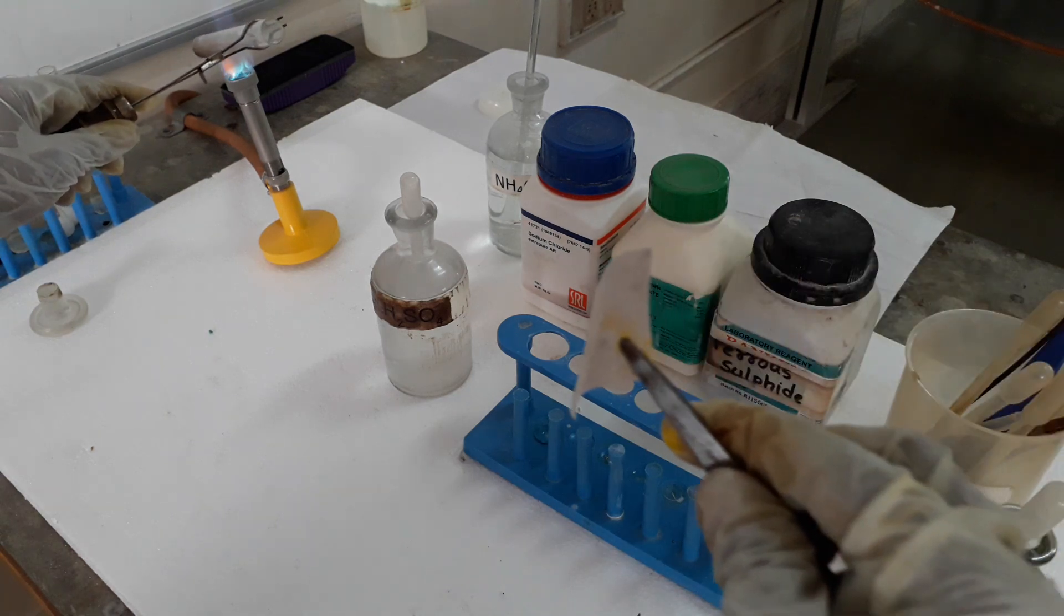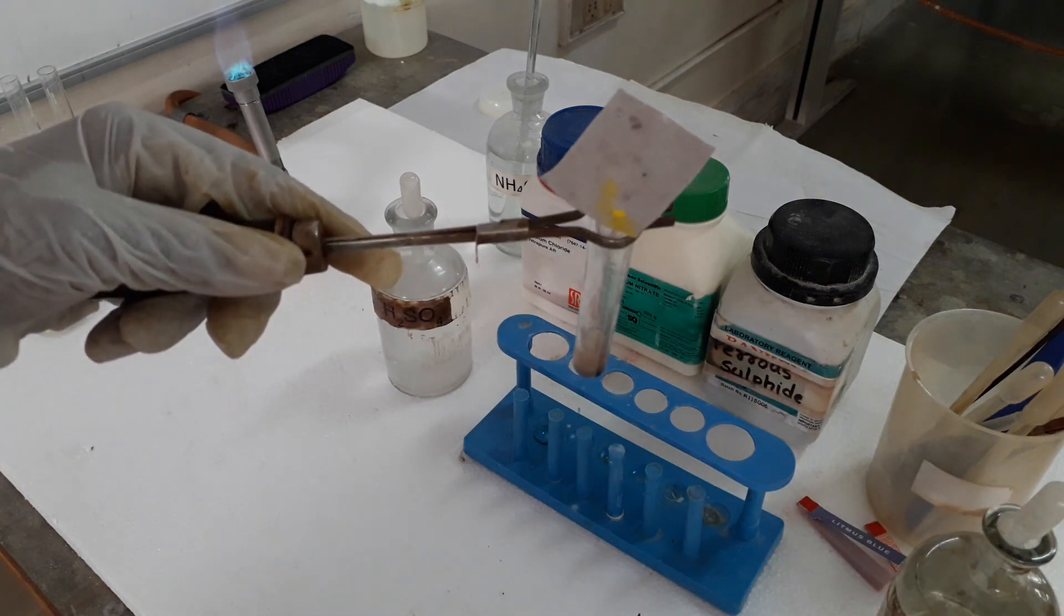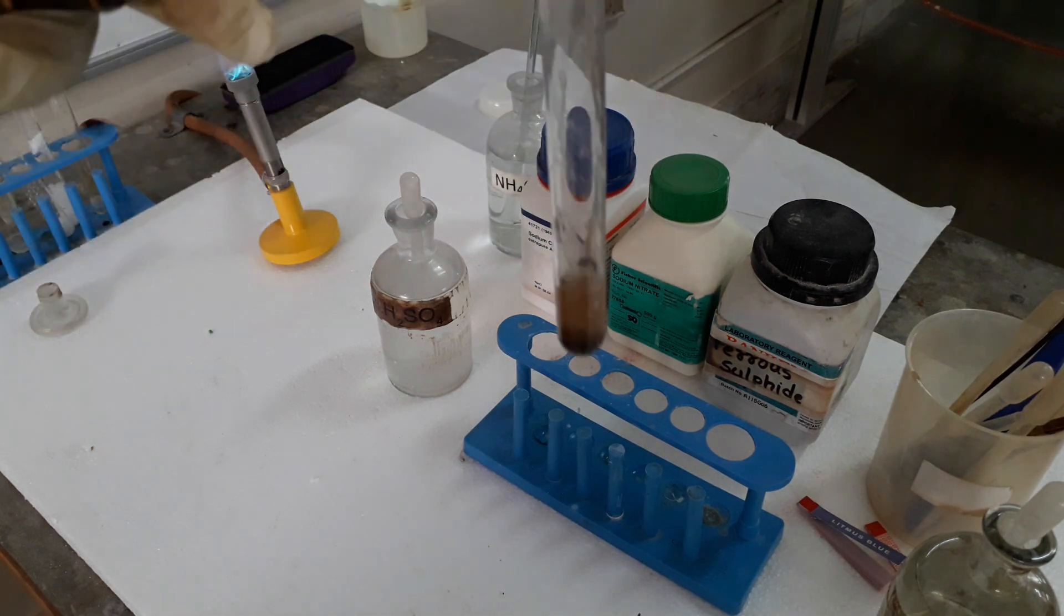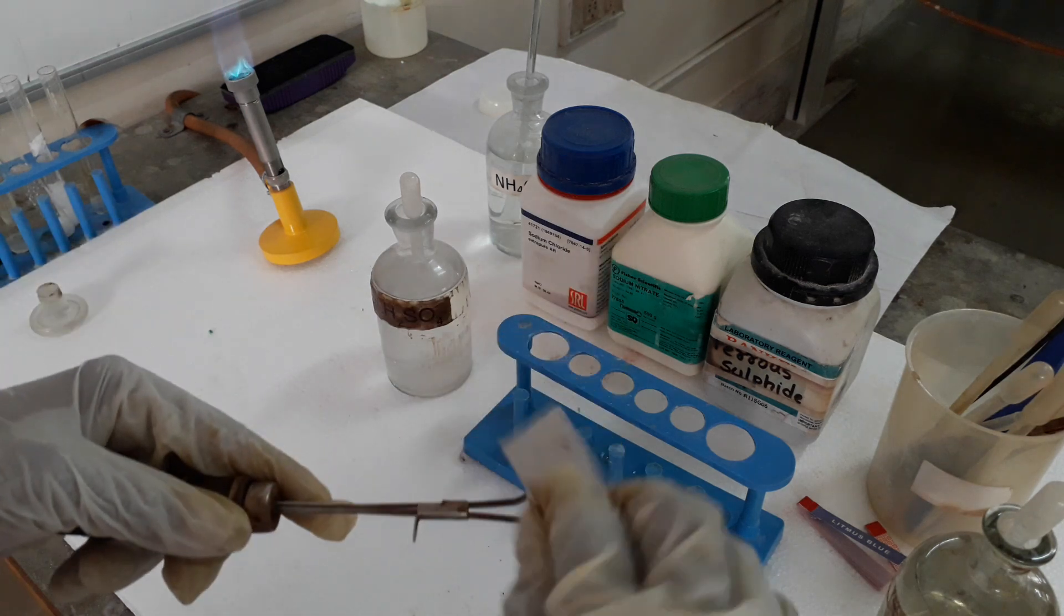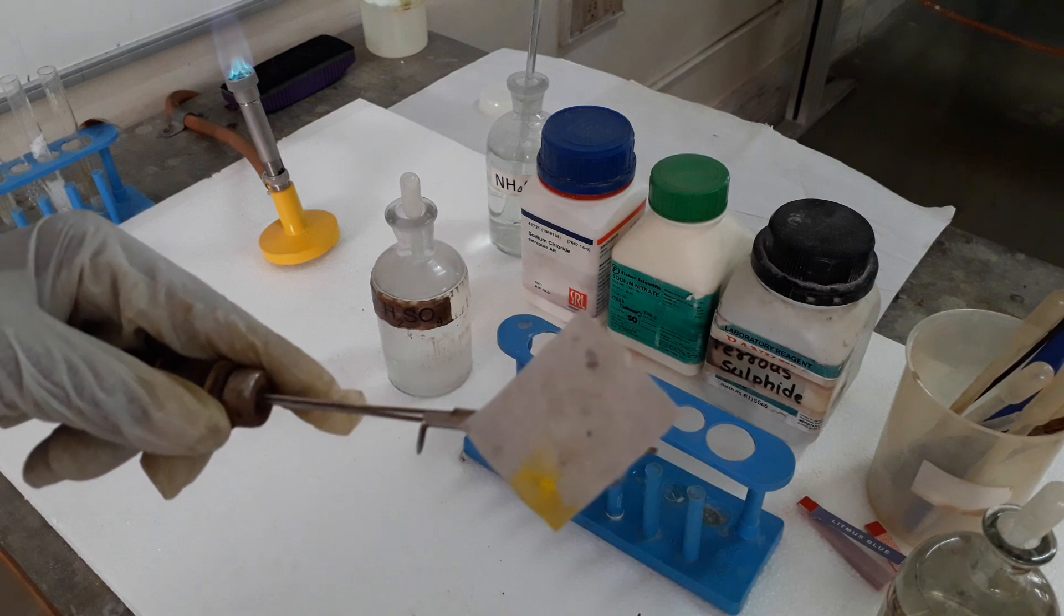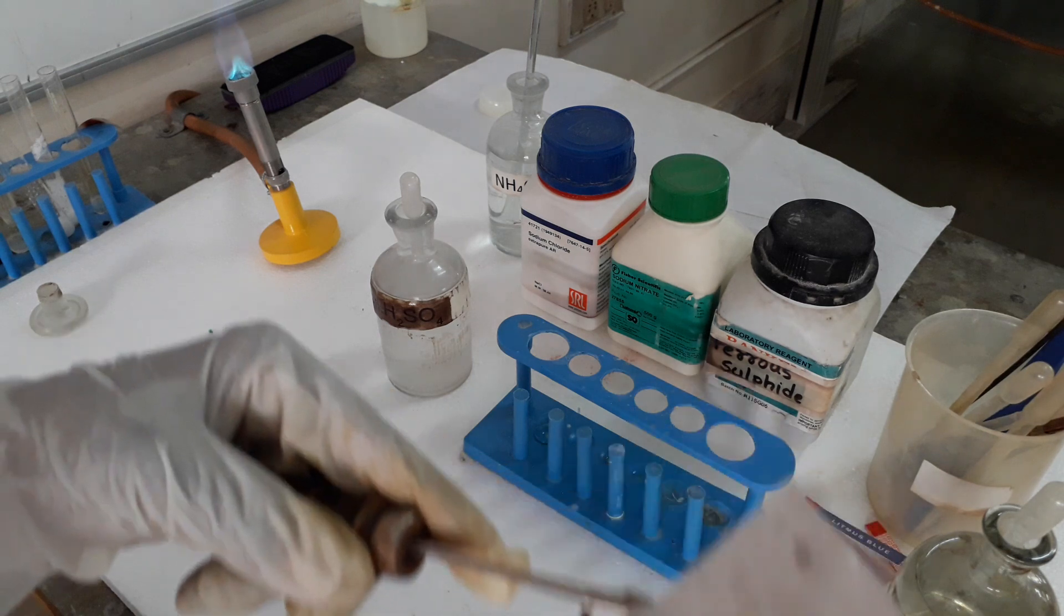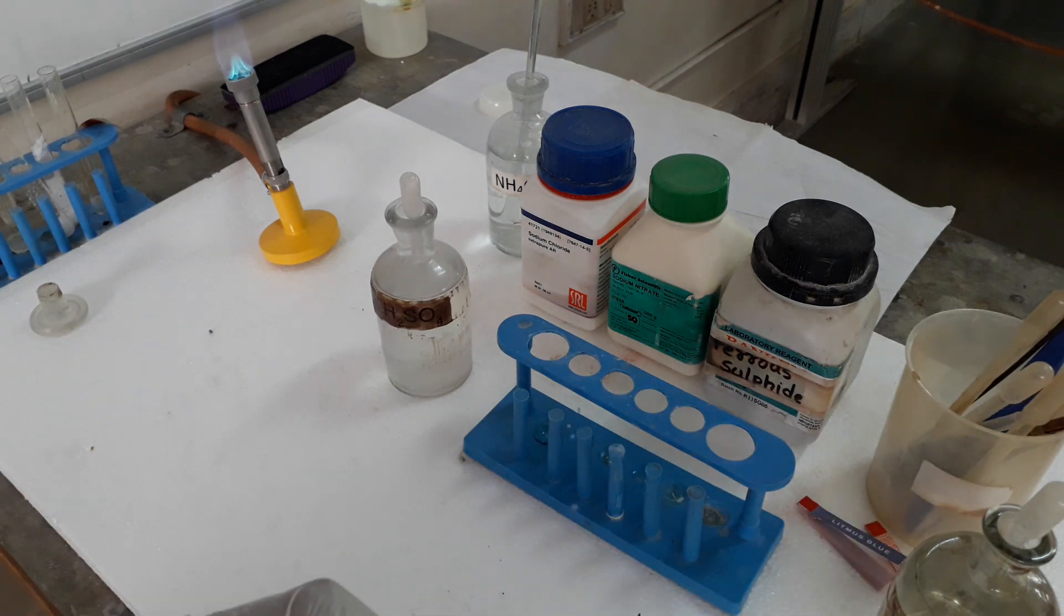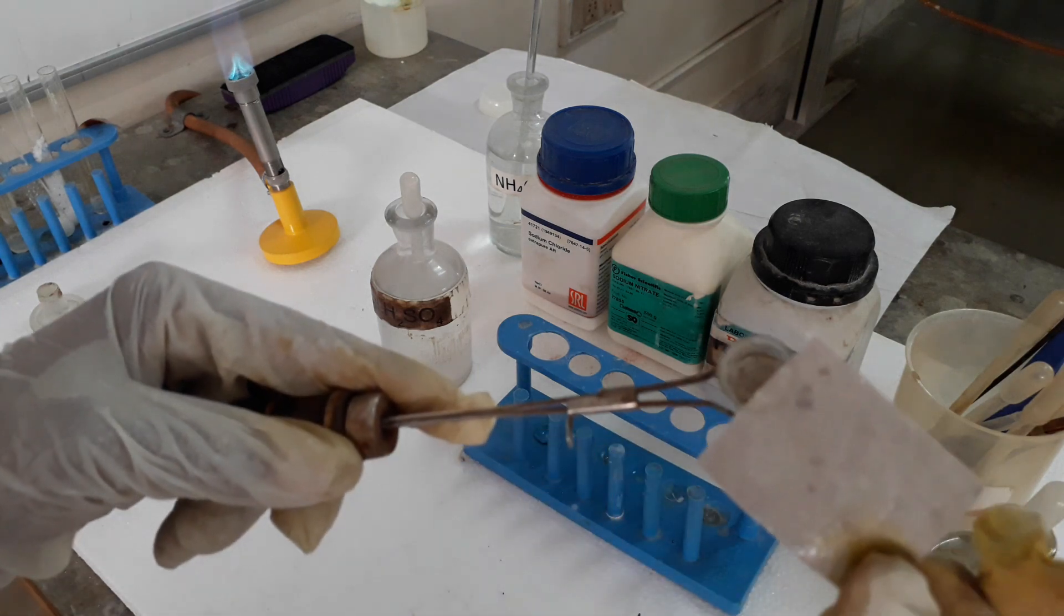The gas has a rotten egg smell and will turn lead acetate paper silvery black. This is lead acetate paper. Here we have hydrogen sulfide gas coming out, and lead acetate paper will turn silvery black. It has started turning silvery black. You can see this shiny black color.